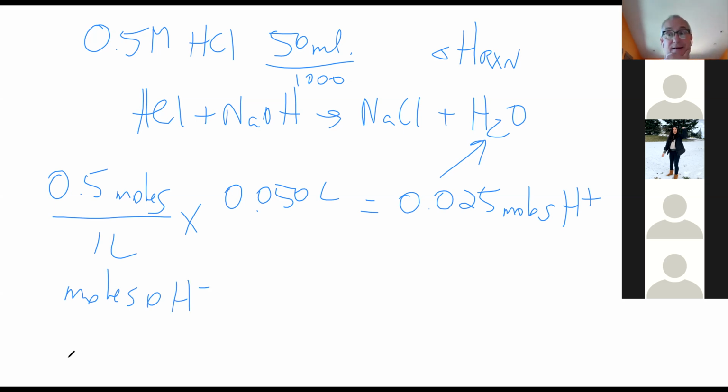How am I going to calculate that? So what form did I add the OH minus? Was it in a solution or was it a solid? Solution.